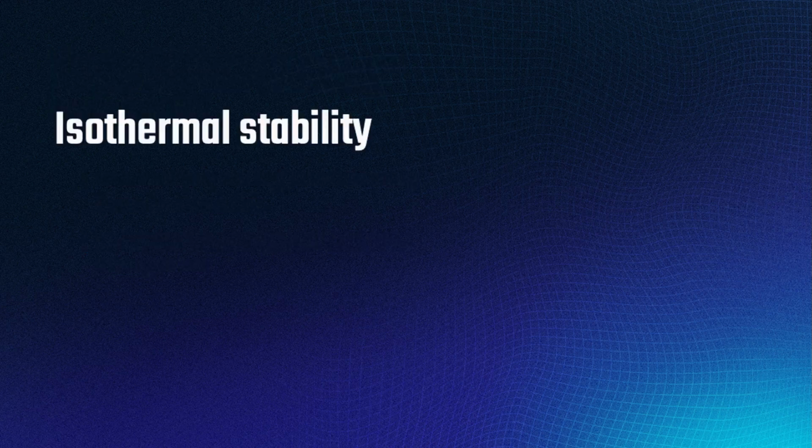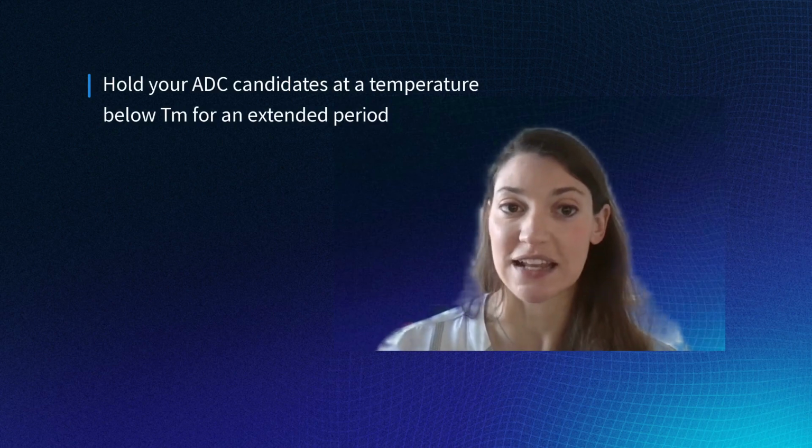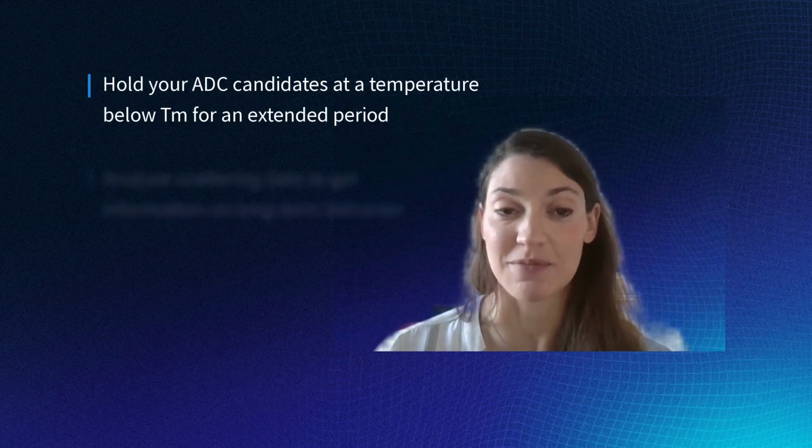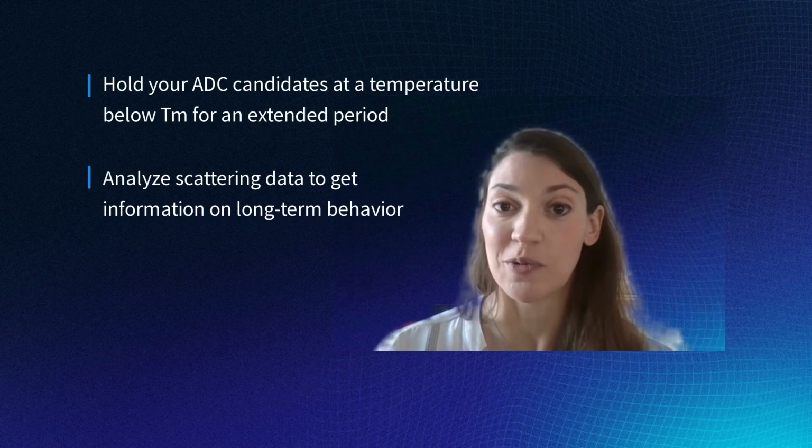Now let's talk about the last predictive measure of stability, and that's isothermal stability. As I mentioned when we were discussing kinetic stability, assessing long-term stability of your ADCs can be a challenge. At this point in development, you need information about which candidates are most likely to be stable without spending a lot of time getting that information. By holding ADCs at an elevated temperature just below their melting temperature for an extended amount of time and analyzing that scattering data, we can get an accelerated look at their long-term behavior.